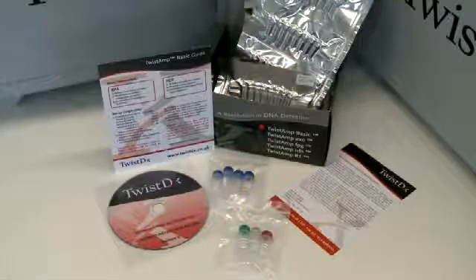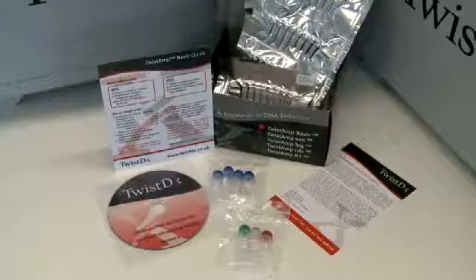Open your TwistAmp Basic Kit. Inside the box you'll find a license card, a quick reference guide, an instruction manual on CD, 96 reactions vacuum sealed in strips of 8 0.2ml tubes, positive control DNA, primers, magnesium acetate and 4 aliquots of primer-free rehydration buffer.